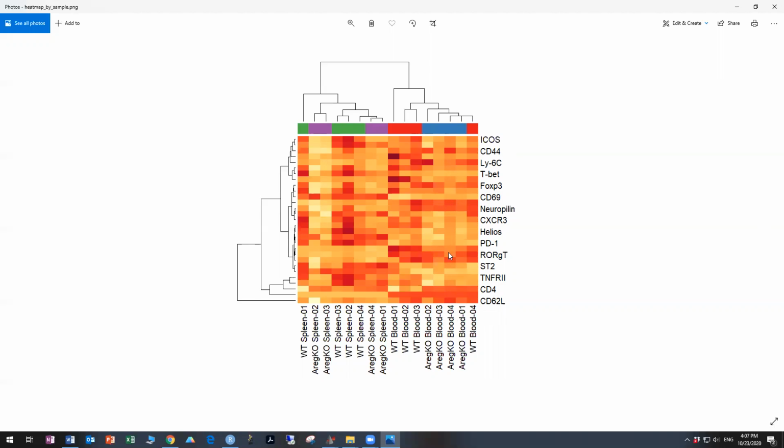And you would say, all right, let's zoom in here and see what it is. And it's this line here is driving some of the difference. And CD4 is also driving some of the difference. Over here in the spleen, it's not so clear cut. We have the samples sort of spread out a bit. It's not quite so clear if there's actually a difference between these two. What can be quite nice is if you get clear grouping of samples in one condition versus the other, you feel relatively confident that there is a difference that is consistent across all samples in your condition.